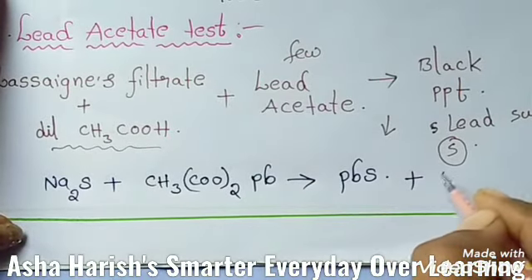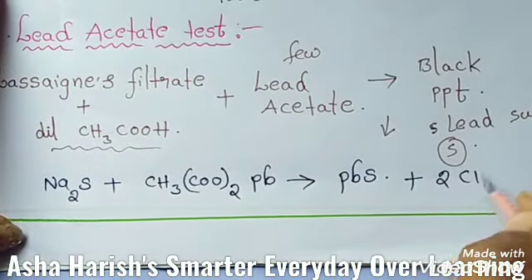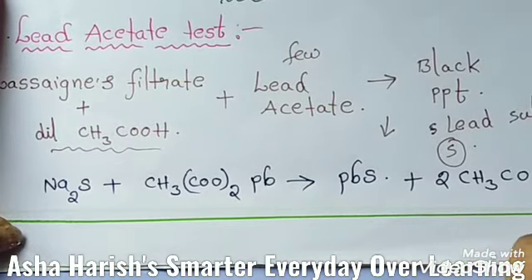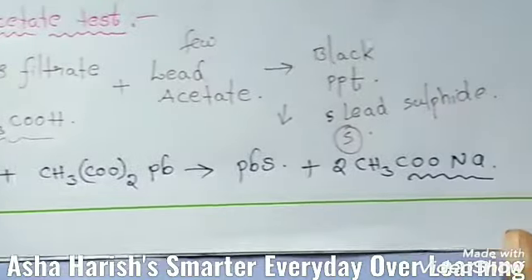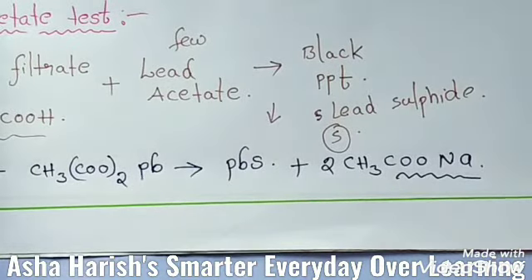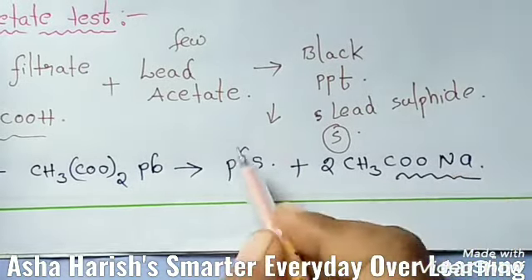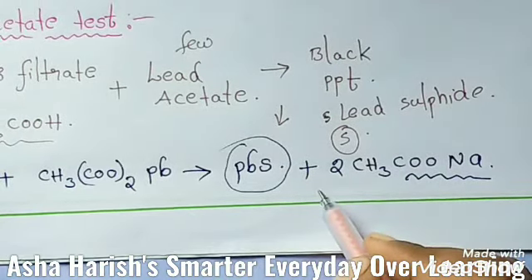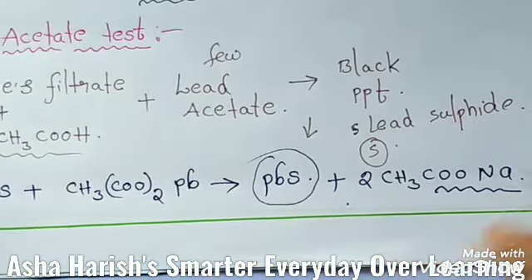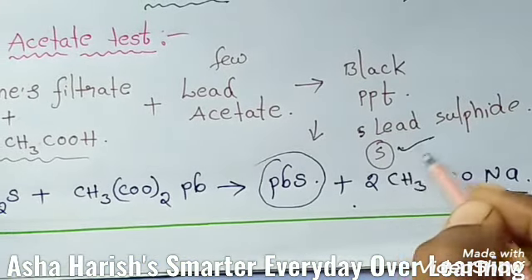And along with this, 2CH3COONa, sodium acetate, will be formed along with lead sulfide. Okay, this indicates the presence of sulfur in that particular organic compound.